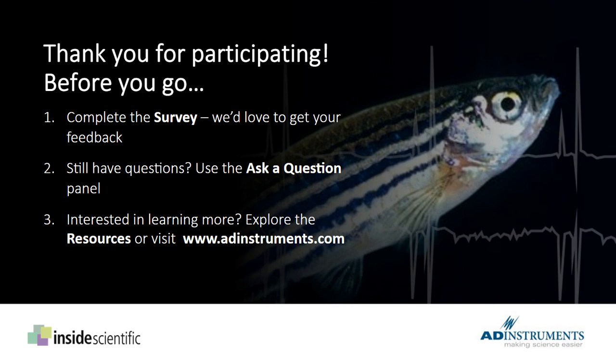We've got another question here. Do you monitor heart rate? And if so, approximately what is the range that you like to keep your zebrafish heart rate in for proper ECG studies? The temperature, if I understand correctly, we do at room temperature. So is that the question? They're asking if you monitor heart rate, and if so, at what heart rate range do you consider a good range for the ECG measures?